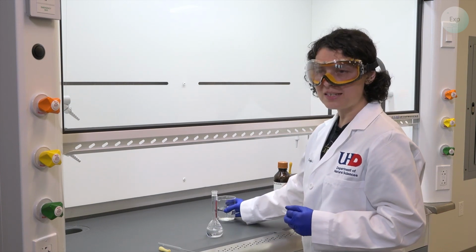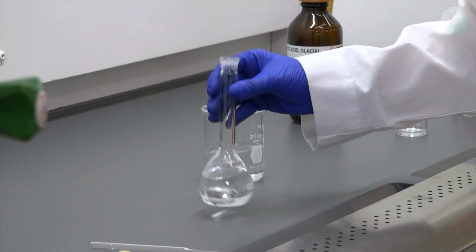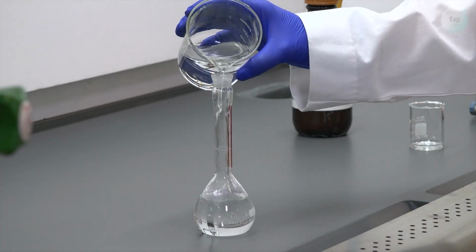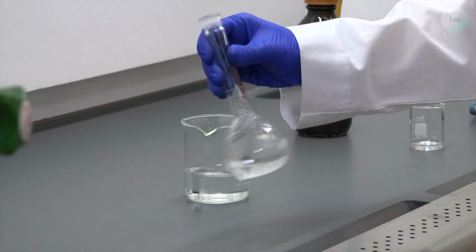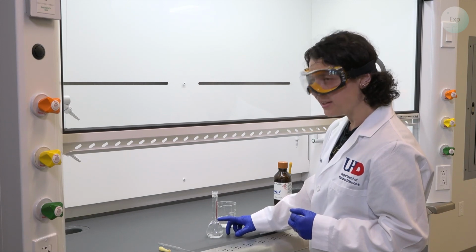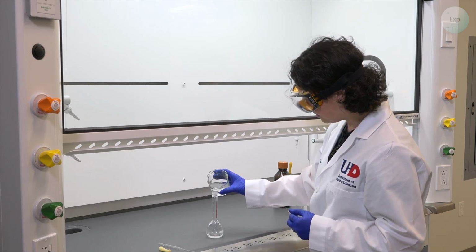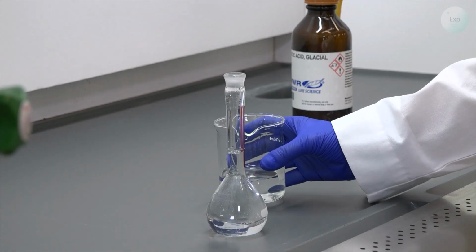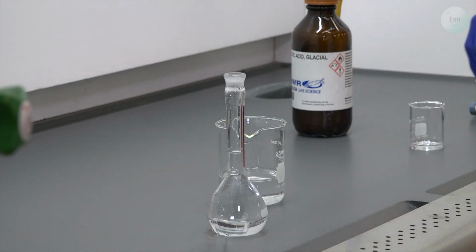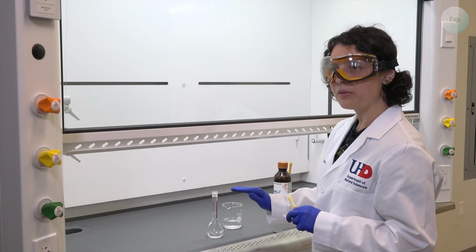For that, all we need to do is add water in increments. Every time we add water, we swirl it to homogenize. Once the solution level reaches close to the neck of the volumetric flask, swirling is going to be very difficult. Once we added enough water that it's near the mark, we can switch to a pipette and slowly add enough water that the solution's meniscus will be right at the marking.